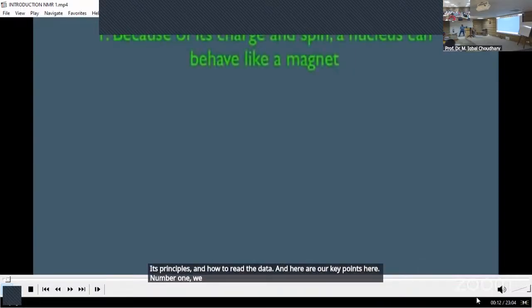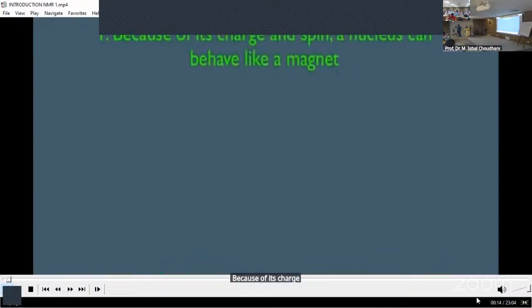This online lecture is an introduction to how the NMR machine works, its principles, and how to read the data. And here are our key points here. Number one, we're going to see, because of its charge and spin, a nucleus can behave like a magnet.